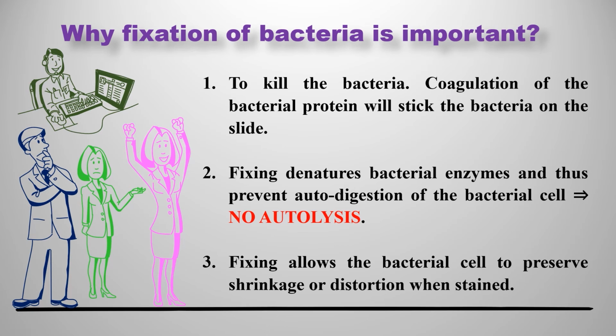The bacterial enzymes are going to be broken down, and this will prevent autodigestion of the bacterial cell. The bacterial cell will not digest itself, and autodigestion means autolysis, so there is no autolysis when I apply fixation to this smear.